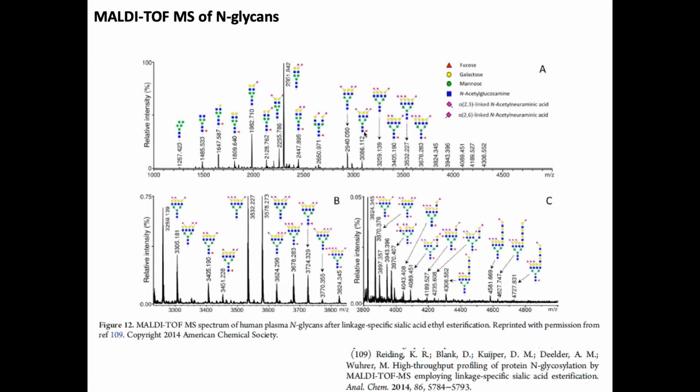You might pool all of your patient sample blood together, run it through a process, and then derivatize it with a light tag. And then every other single patient sample, you put a heavy tag on. And so now you spike every patient sample with a heavy tag on it into your light standard. And so now you've got pairs that you can actually look at and get relative information. And it's not an absolute concentration, it's a relative concentration. So that's going to be something to keep in mind when we move to the second part of the lecture series.